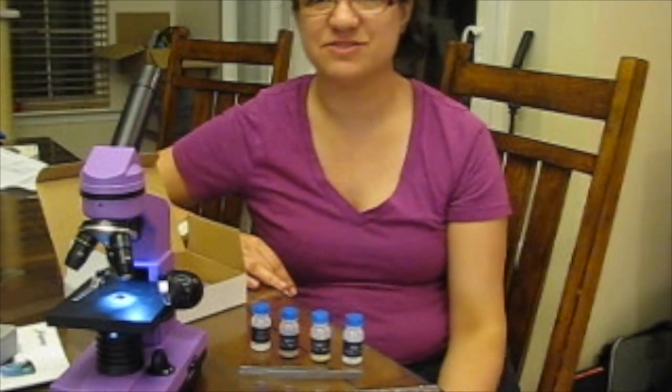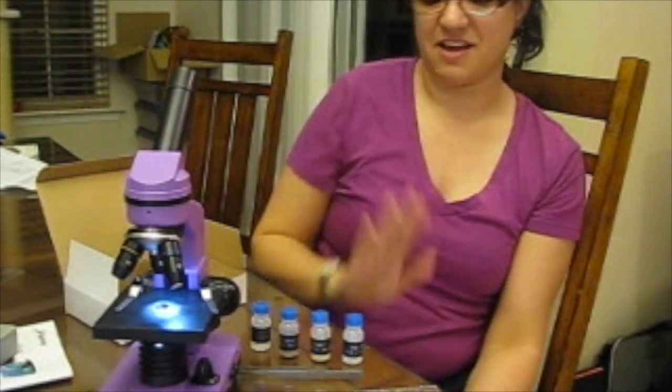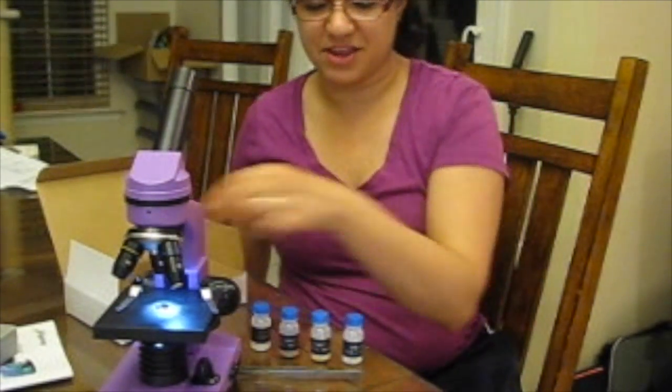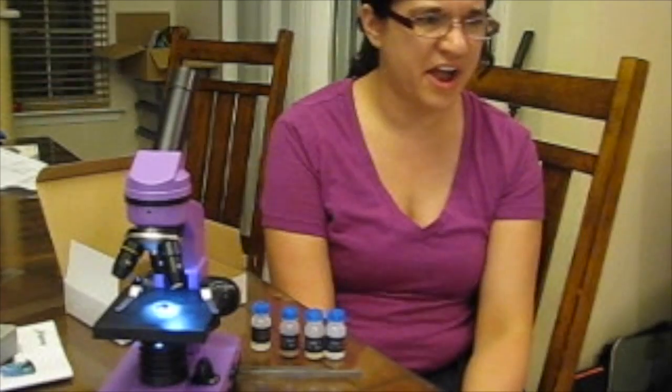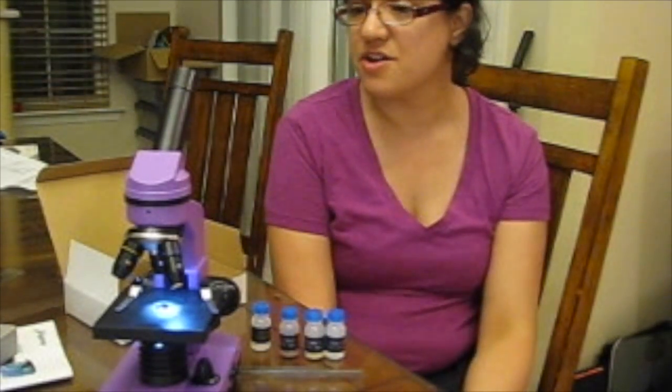And my kids are really enjoying it. My eight-year-old particularly is fascinated with science and I think she is just amazed by seeing what some of these everyday plant and other objects look like when you magnify them up 100 or 400 times.